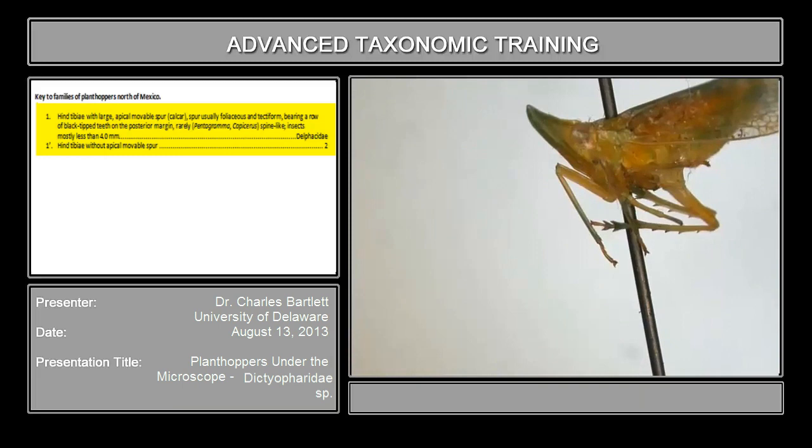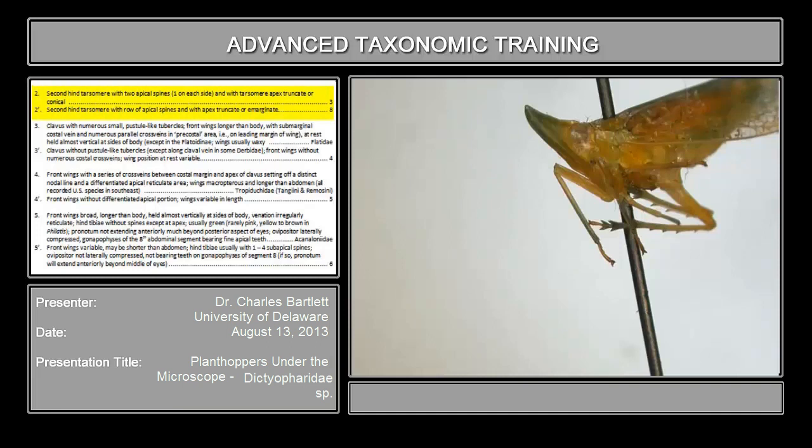So it is not a delphacid. The second couplet reads that the second hind tarsomere bears two apical spines, or the second hind tarsomere bears a row of apical spines. That's the first tarsomere; that's the second tarsomere, and the second tarsomere bears a row of spines. So from here we proceed to couplet 8.